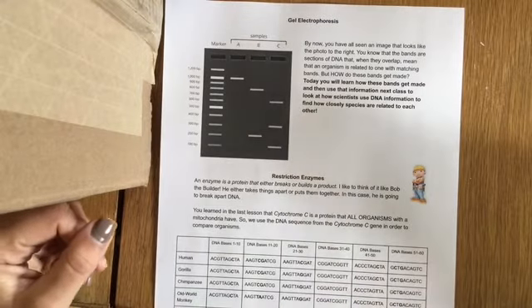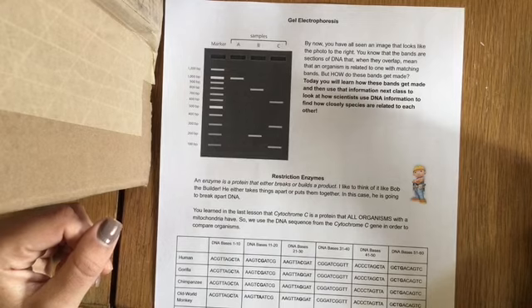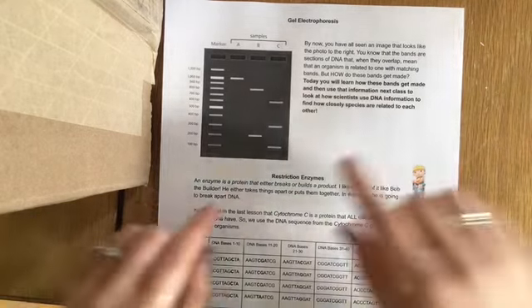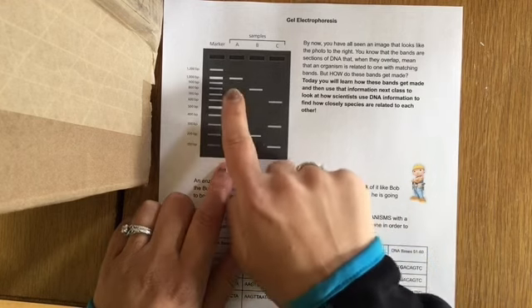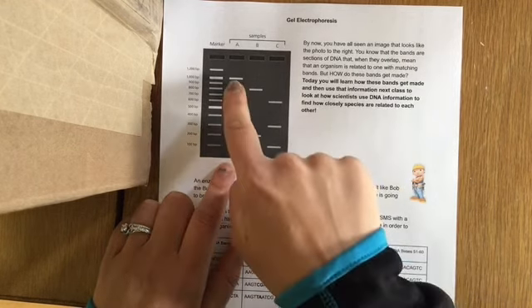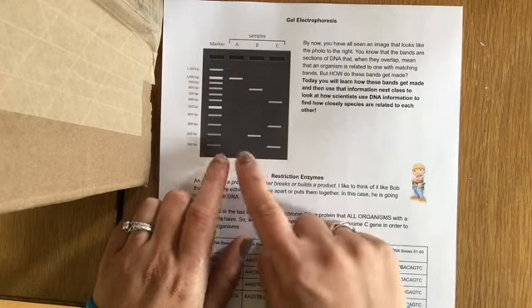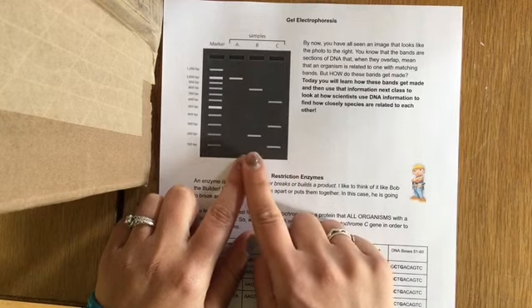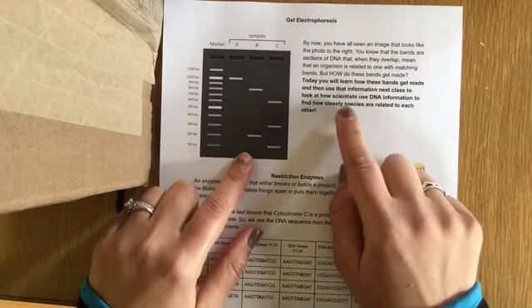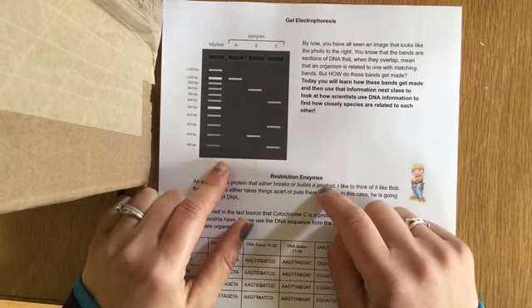Hello, ladies and gentlemen. So today we're going to go over gel electrophoresis and how it relates to evolution. At this point, you have all seen pictures like this before, and you know that this is DNA, and these are different bands of DNA. We can tell if things relate to one another because their bands either match or they don't match. But what we are going to do is look at how these pictures are actually made.